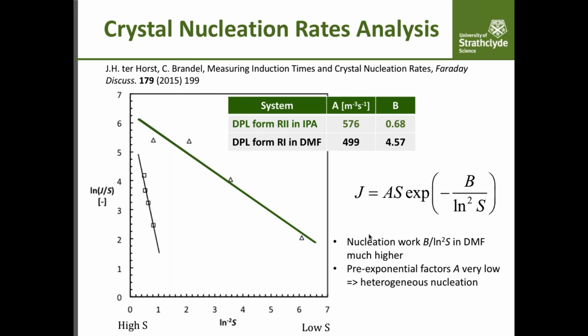It also shows that our pre-exponential factor is much smaller than we expect from theories, which indicates that there is some kind of heterogeneous nucleation process taking place. So there are some kinds of particles in the solution which cause heterogeneous nucleation.